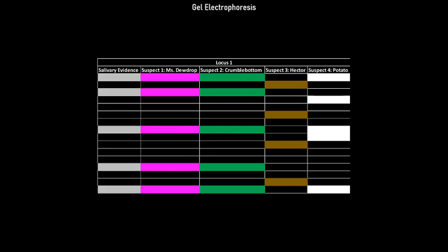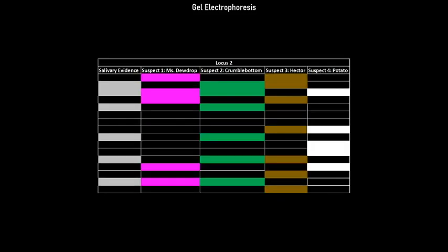The results from the completed gel for loci 1 is depicted. In loci 1, both Ms. Dewdrop and Crumblebottom match the salivary evidence, suggesting either could be the culprit. This overlap is a product of genetic similarity because Ms. Dewdrop is Crumblebottom's biological mother.